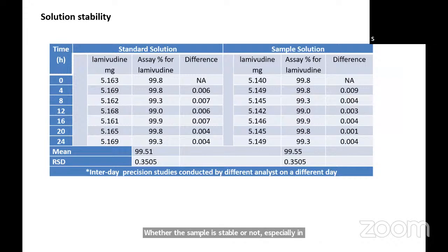In the case of water or DMSO as solvents, we found many compounds get degraded or give multiple signals, especially sodium acetate. If you prepare a solution in D2O, because sodium acetate is the salt of a strong base and a weak acid, it will dissociate and be in kinetic equilibrium with sodium hydroxide and acetic acid. That is the problem with sodium acetate. So we fix the time limit up to which the standard solution can be kept.